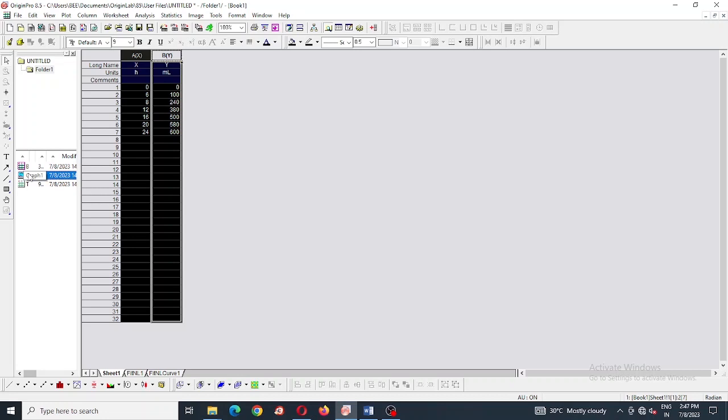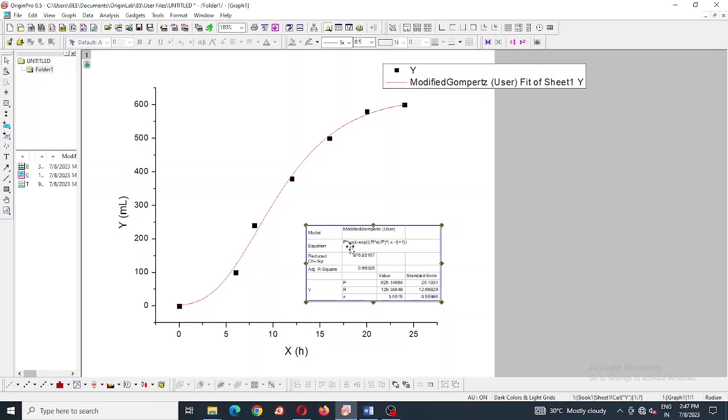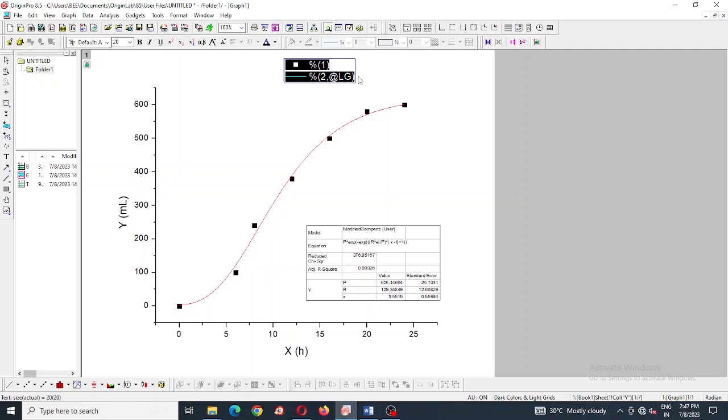Now, we are coming to graph, the graph has been generated properly. Here P is 625 ml, and R is 129 ml per hour, and X is 3.6 hour. Adjusted R square is 0.99.